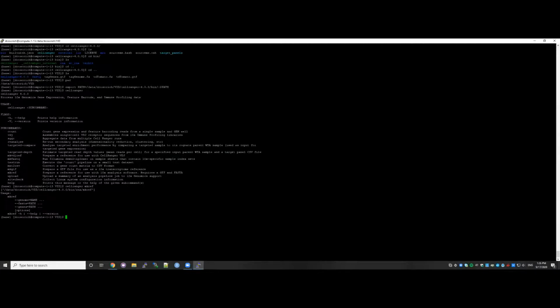It's the name of the genome that you are going to create, the FASTA and the genes. So I'm going to do makeref, minus genome, and I'm going to use TD tomato musculus 10. I decide what is the name. You can decide your own.